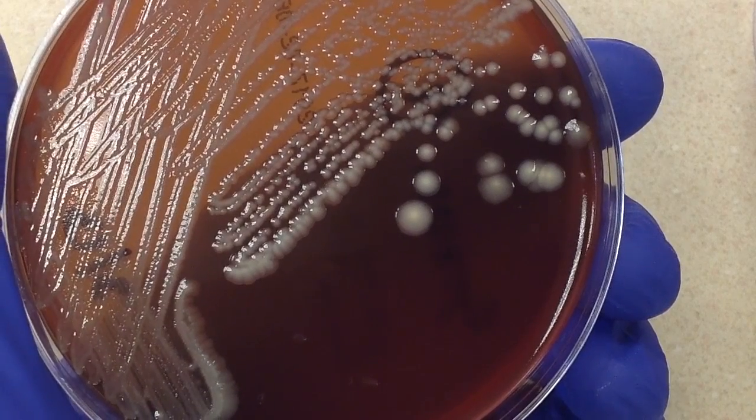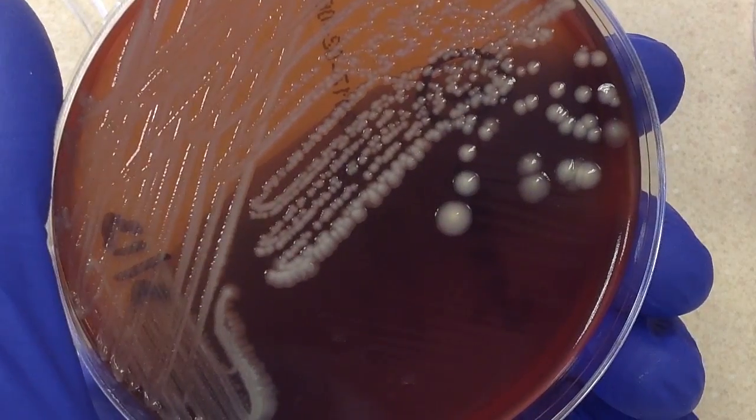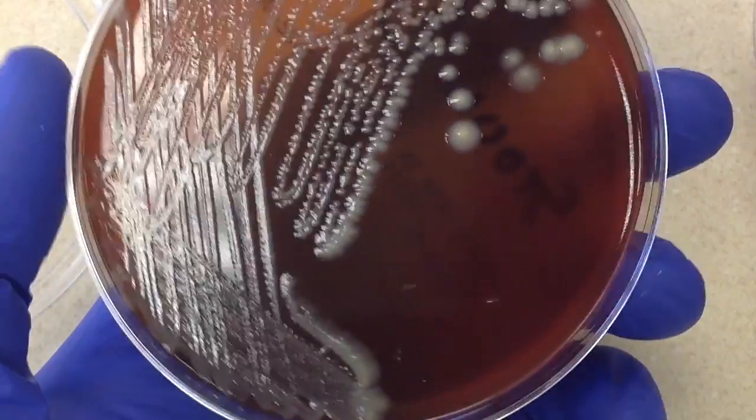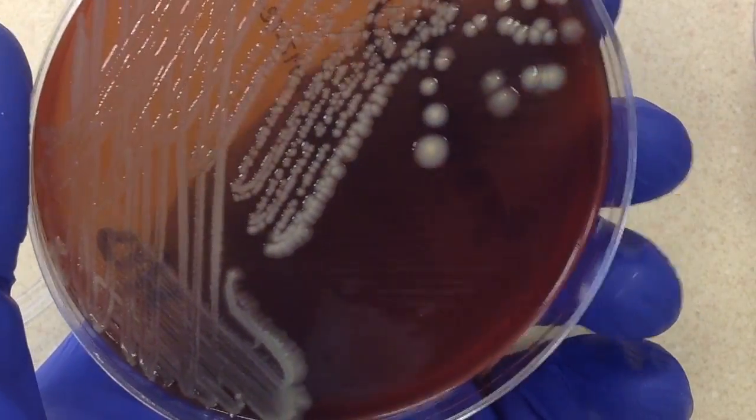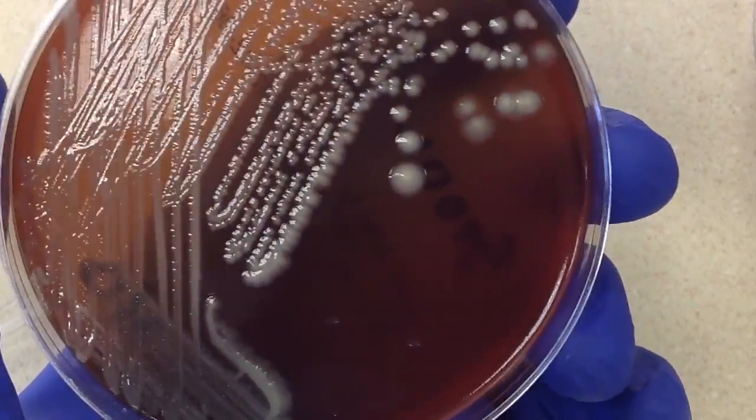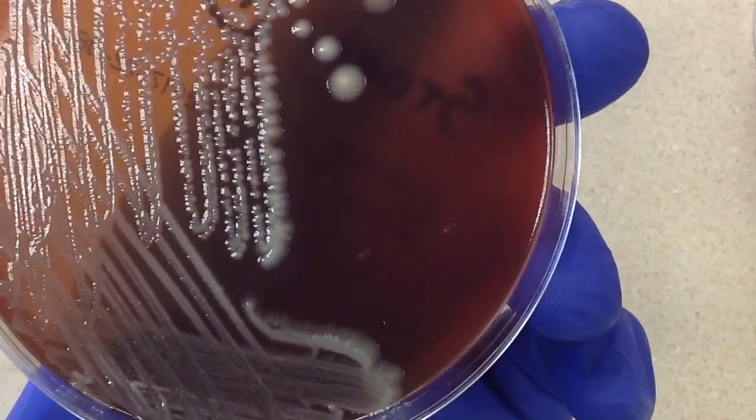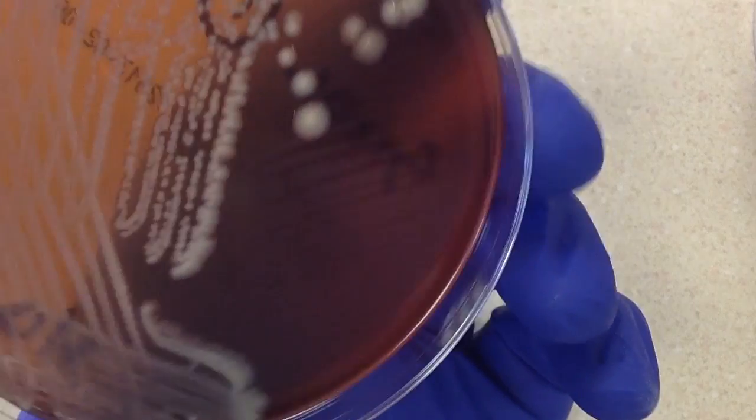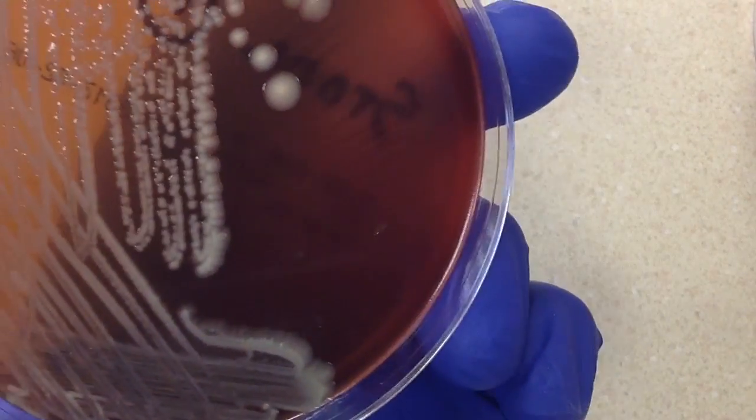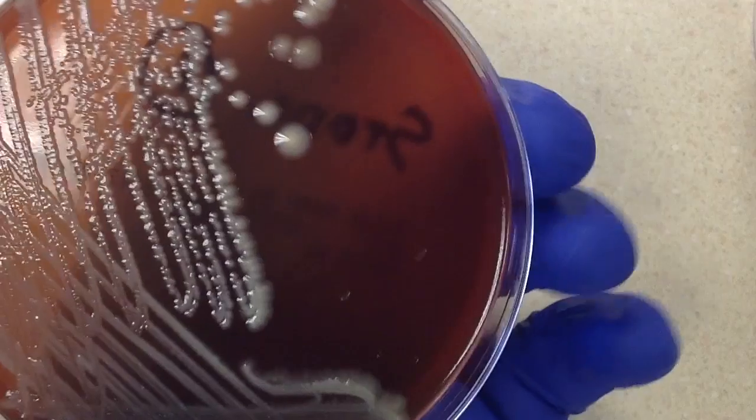Stool is definitely a culture site that has normal flora. So a lot of gram-negative rods from the family of Enterobacteriaceae. We can see other things in there, Enterococcus species, staph. It's really a mixed bag of different organisms.